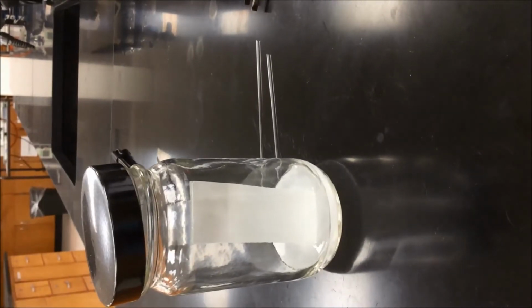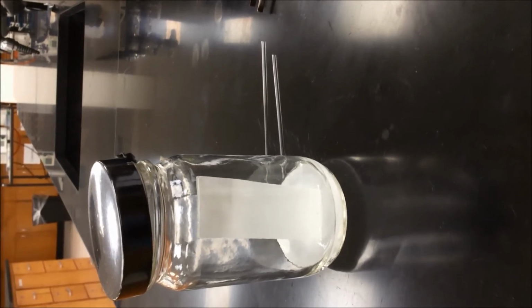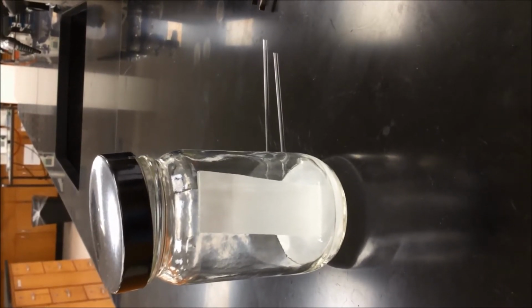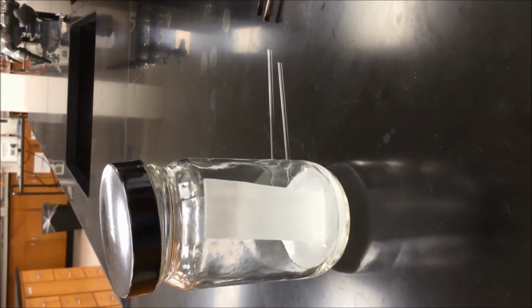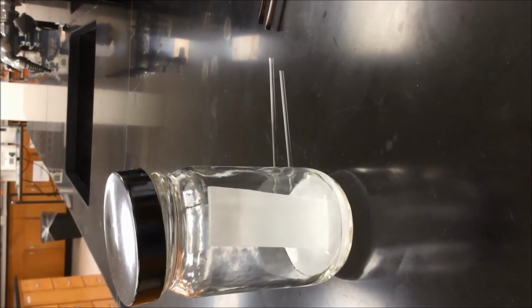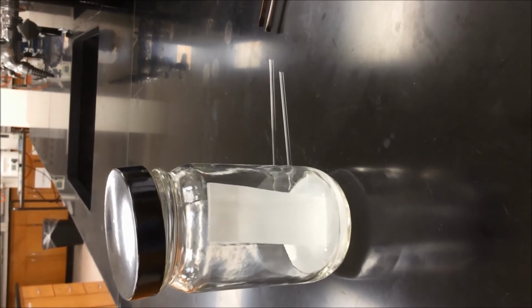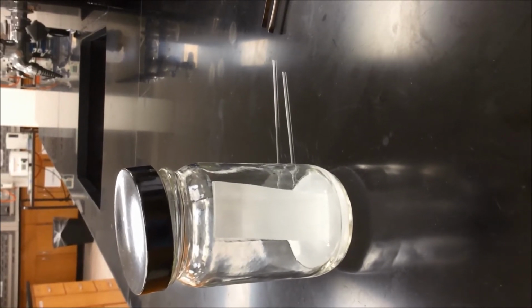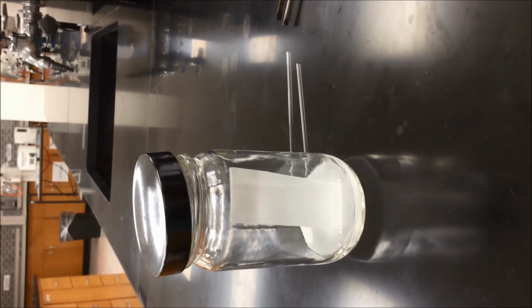Okay, so as you can see, my eluent is rising and it's going through the TLC plate, and it has gone up to probably about a centimeter. So I'm still going to let it run. Like I said, the farther that it runs, the better separation we would have, and so we'll have a better picture of the RFs. Now you might ask, what is an RF?